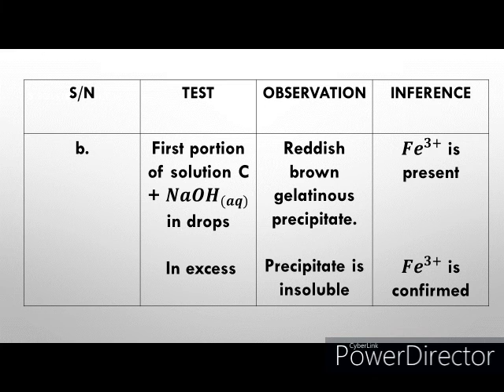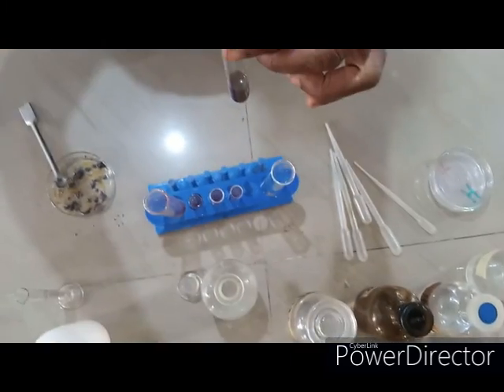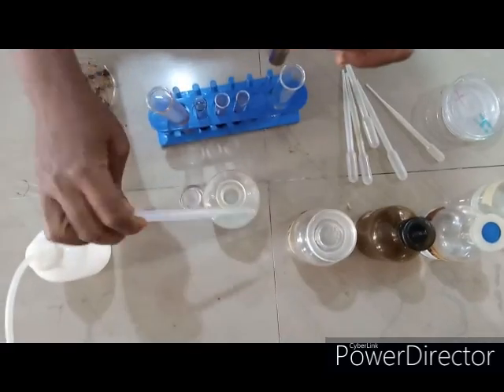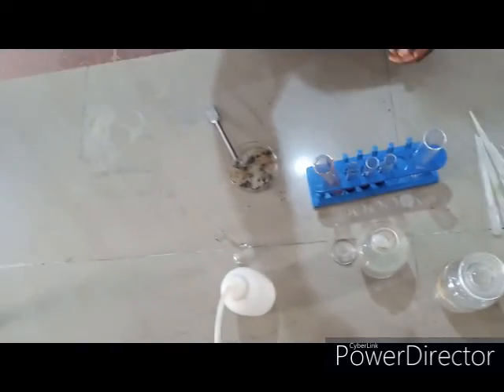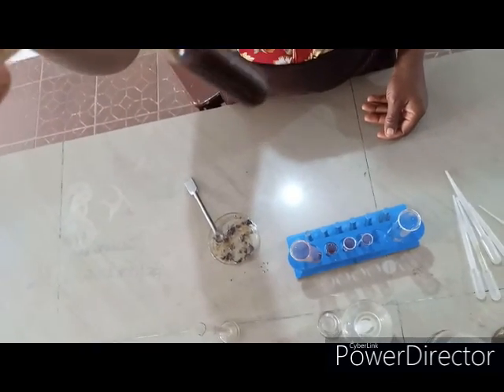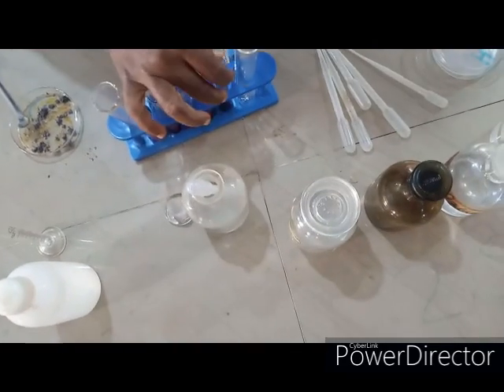Our inference is iron 3 plus is present. Now add sodium hydroxide in excess and check whether the precipitate will dissolve or not. As you can see, the precipitate remained insoluble. Iron 3 plus is confirmed.